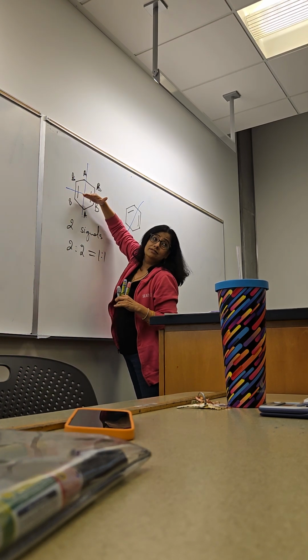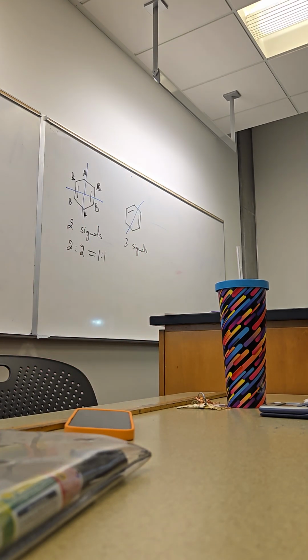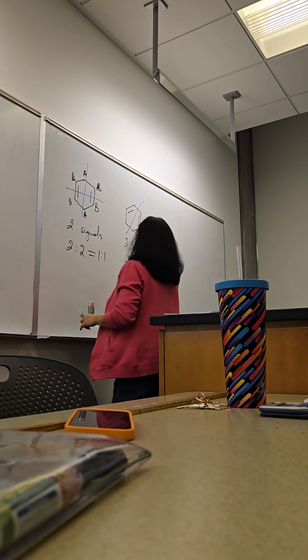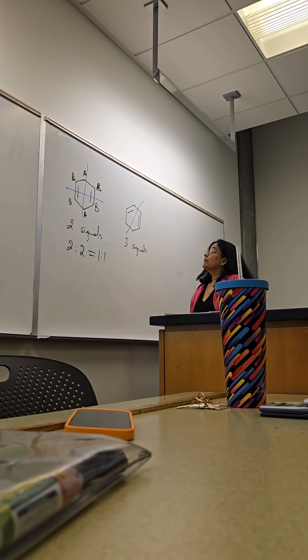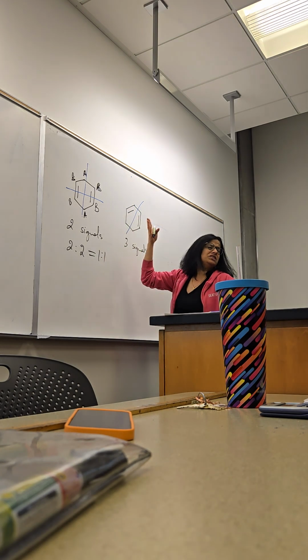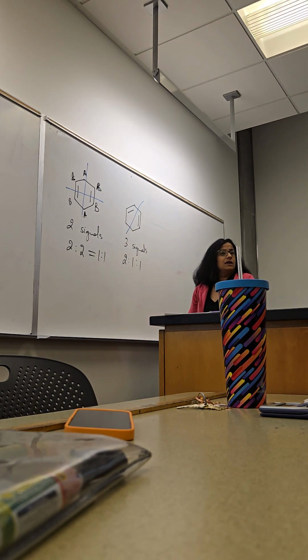If you're looking at this, oh, that's right. There are 2 hydrogens on the top. Yeah, there are 2 B's on the top, 2 B's on the bottom, and one on the careful. Good point, good point. One on the bottom. What about the integration here? 2 to 1 to 1. 2 to 1 to 1 or 1 to 1 to 2, whichever way you go, absolutely. Everybody okay? Yep. What about multiplicities?